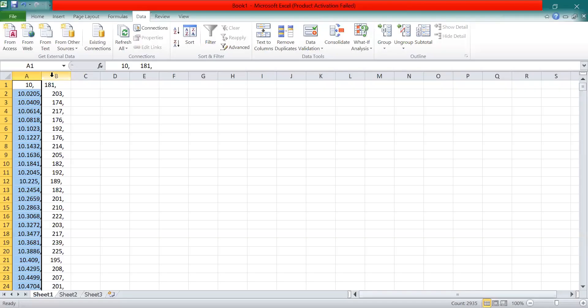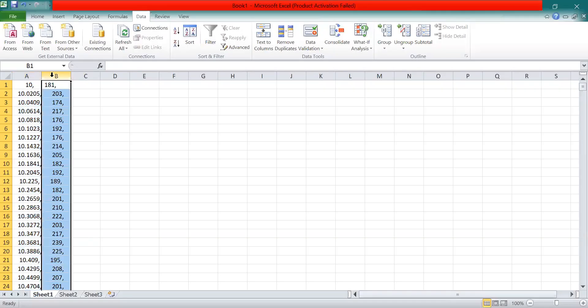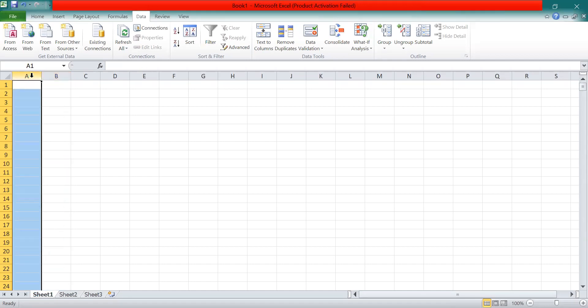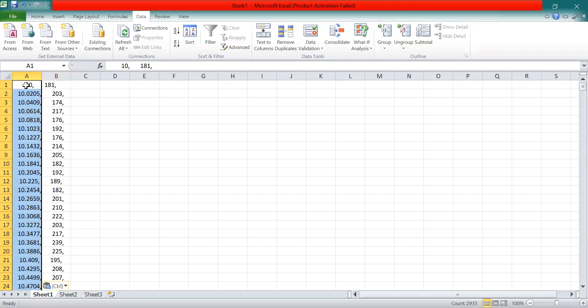Now I'll paste the whole data here. You can see we still have a comma in the data, so next we should remove this comma from the data.